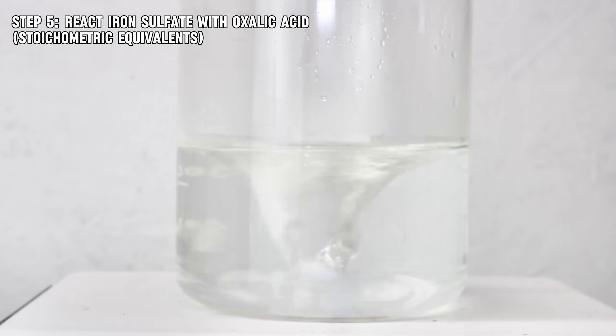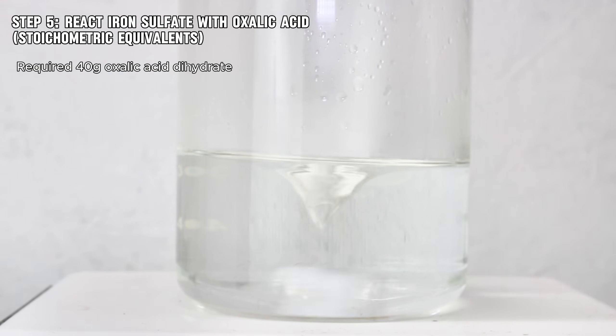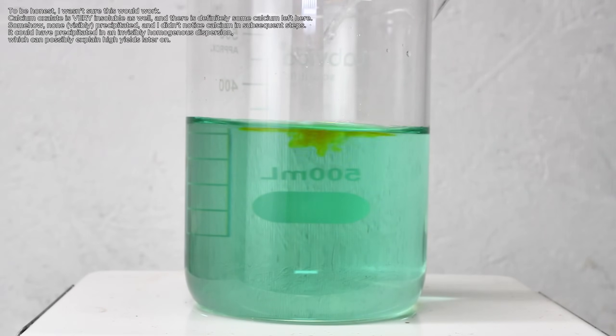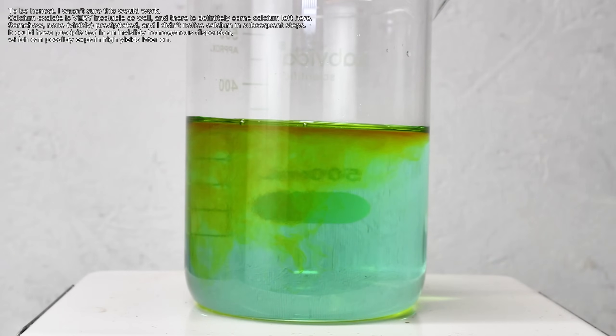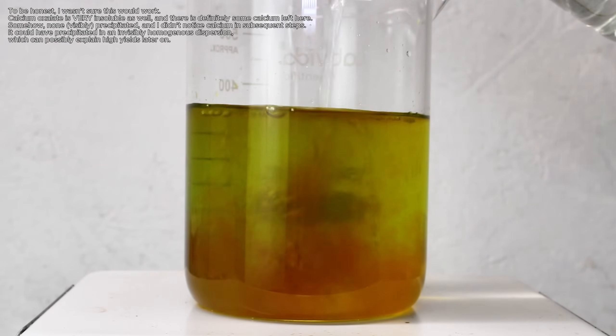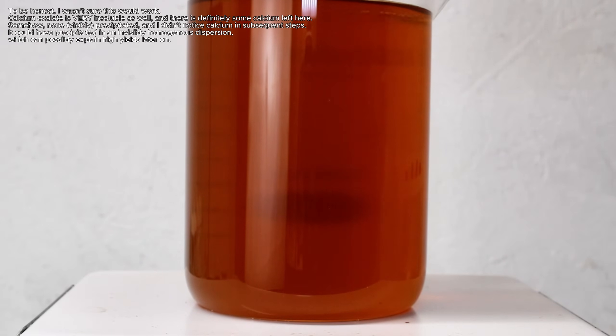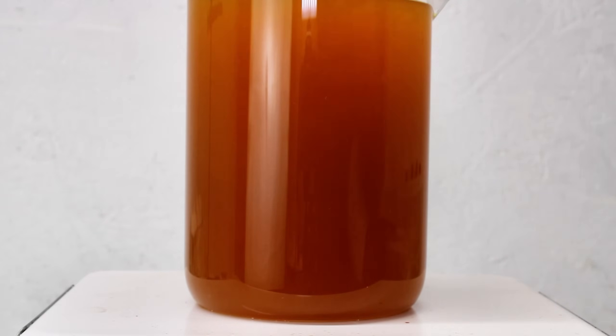To do this, I first made a solution of oxalic acid by dissolving 40 grams of oxalic acid in a minimal volume of hot distilled water. I then added the solution to my iron sulfate extract, which suddenly turned the solution a dark red-orange, which quickly changed to yellow as insoluble ferrous oxalate precipitated. This reaction was so unexpectedly beautiful that it feels like a crime to let it play at 20 times speed, so I'm going to let it play out.